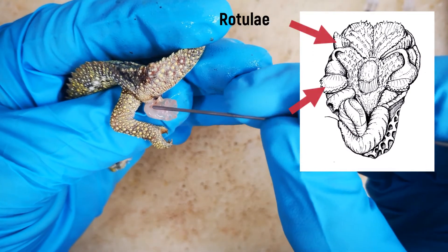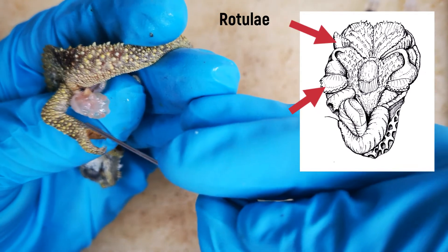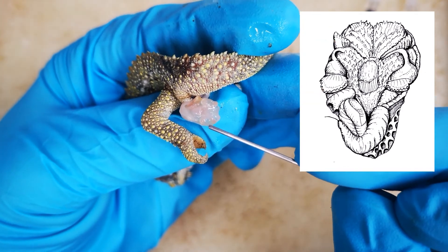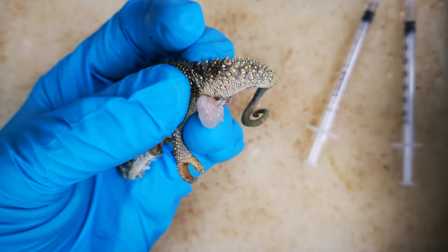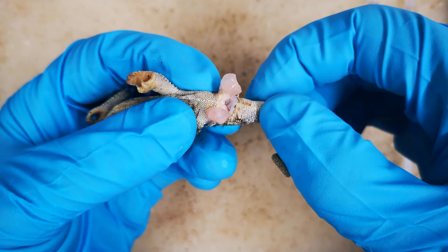The hemipenis of Trioceros hoehnelii has two pairs of rotulae on its distal surface: one asulcal as we have seen before, and one sulcal. Between them is a broad and flat surface that has a field of papillae, which are best seen under the microscope. Note also that preparation technique differs a little depending on the squamate group being prepared, because lizards that can drop their tails require a little more care during manipulation.